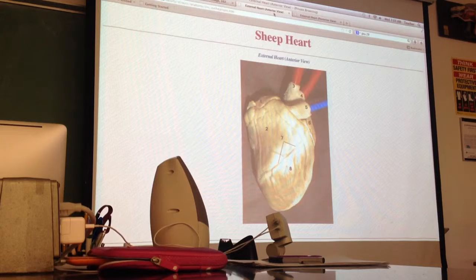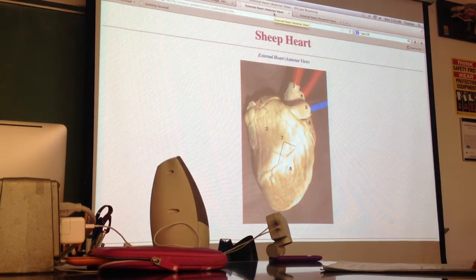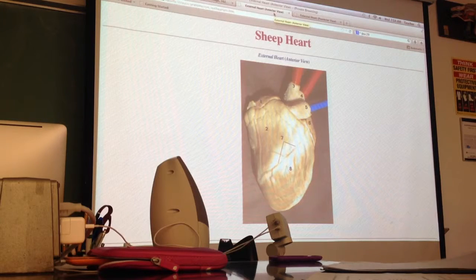Now, there are a handful of structures that you're going to need to identify externally, including some of the vessels. Now, I want you to do your best to identify these, and I'll give you ways that you can do that as we go through the internal anatomy. But these 3 that I'm going to point out right now are very, very difficult to find. And if you were given a heart externally like this, I would not anticipate that you can identify them. Okay, just because you really do need to see which ventricle they're going into, for example.